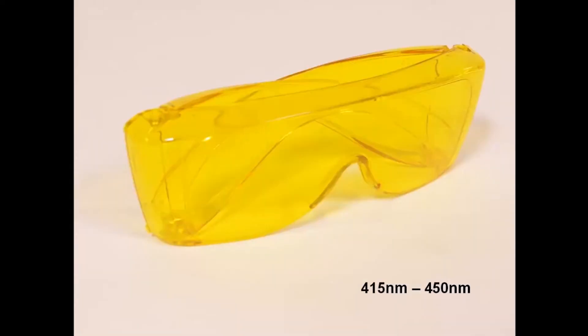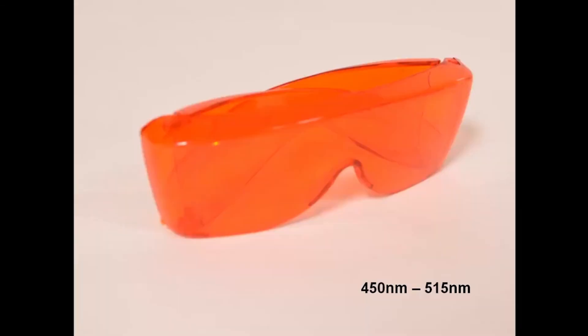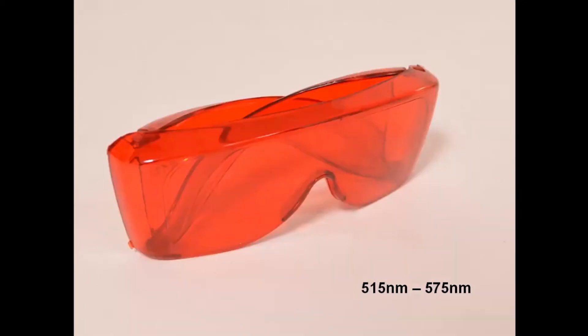Yellow goggles tend to be used in the range from 415 to 450. Orange goggles are used from 450 to 515 nanometers. Red goggles are used from 515 to 575 nanometers.